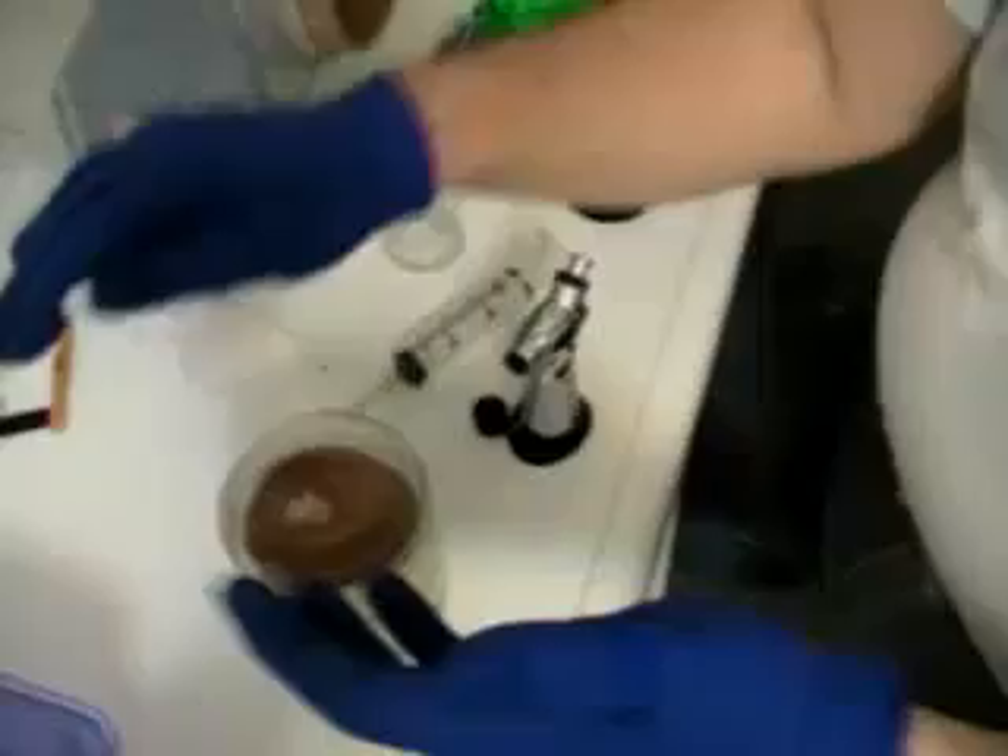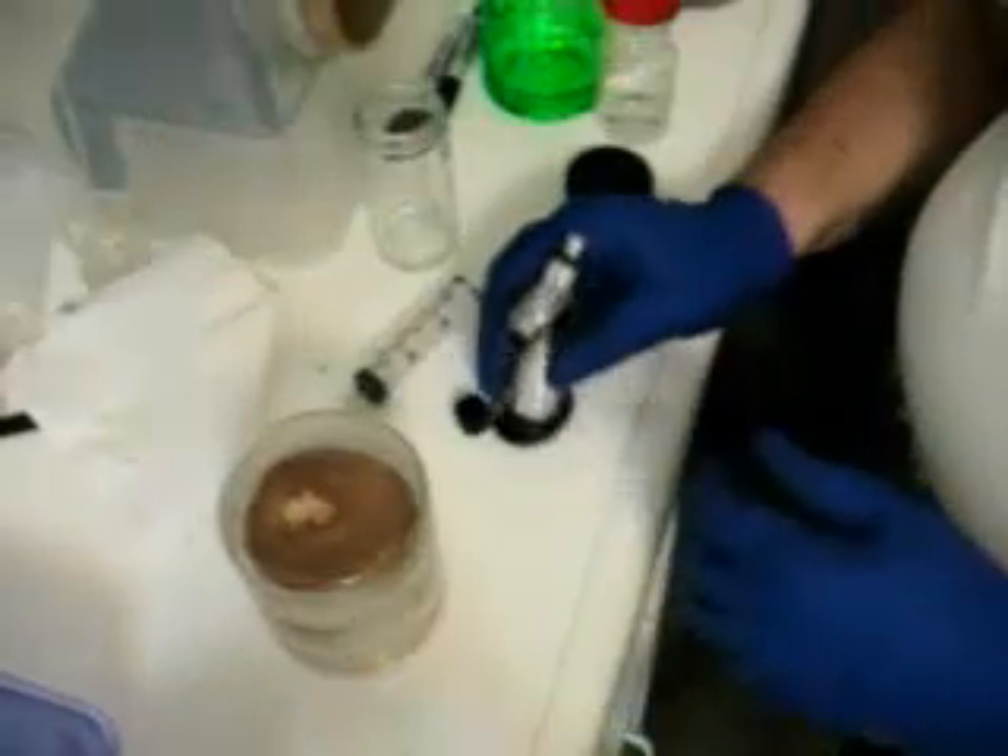Alright, here we are about 12 hours later. Whenever you're doing mycology processes other than harvesting, you want to put gloves on, rub your hands with alcohol, wear a mask, and use reasonable sterile procedure.